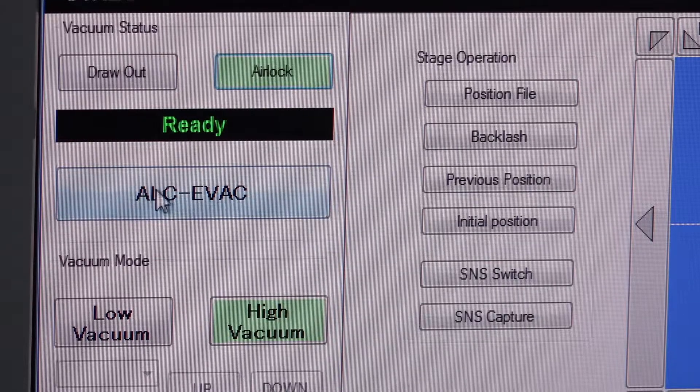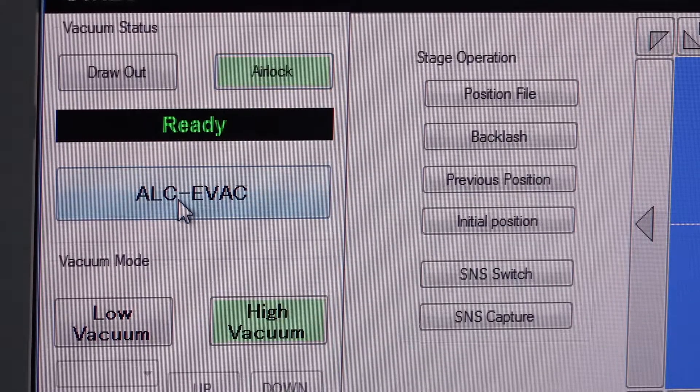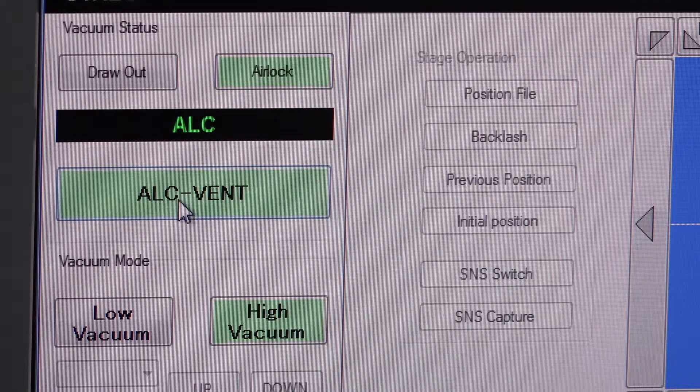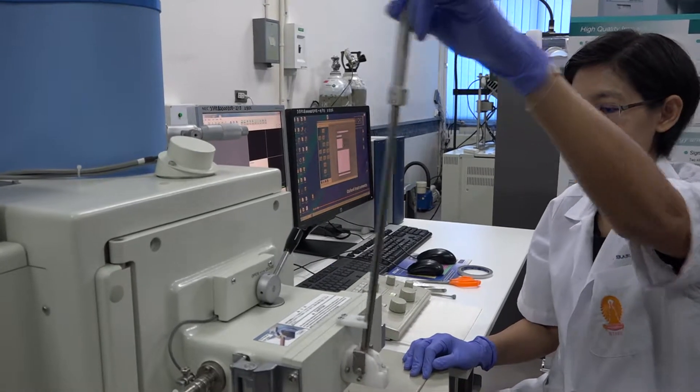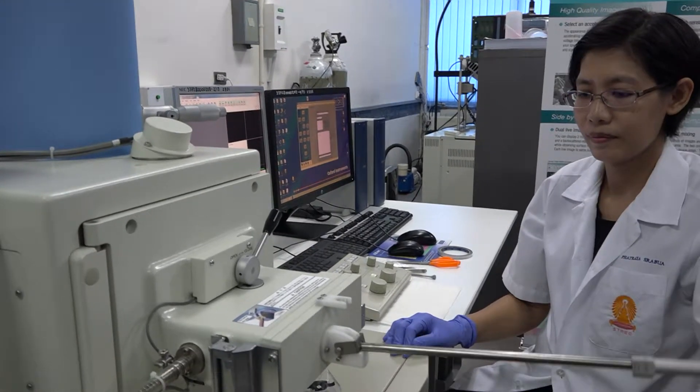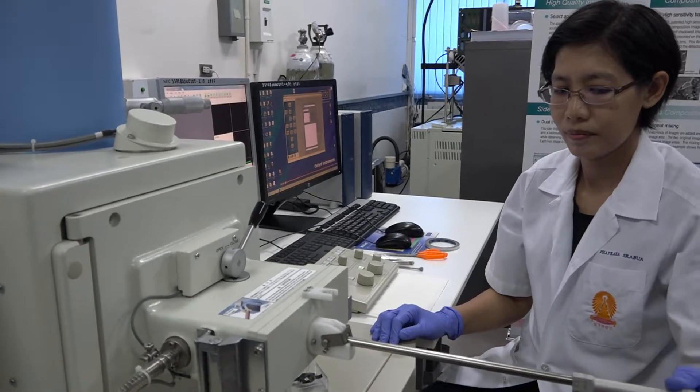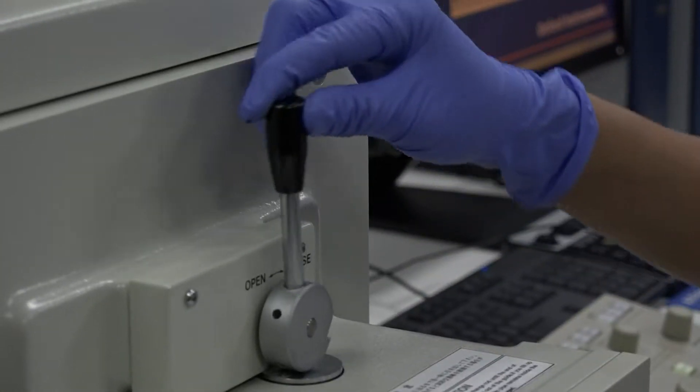The SEM is a microscope that uses electrons to illuminate a sample instead of visible light used in optical microscopes.